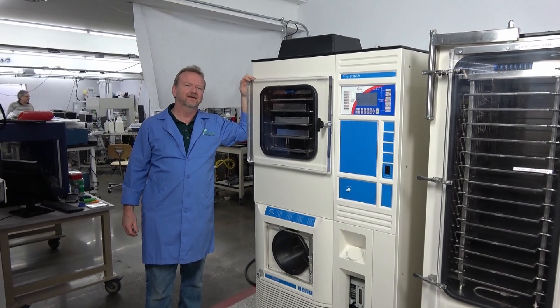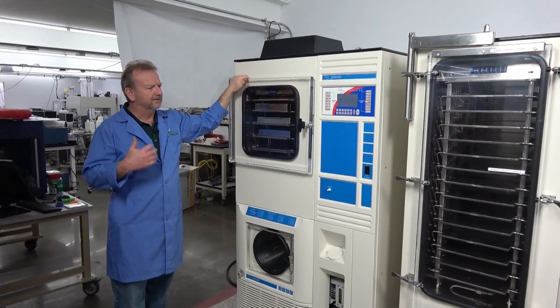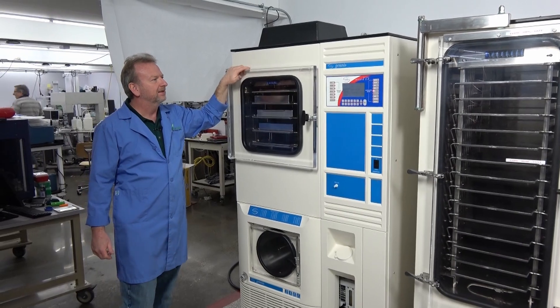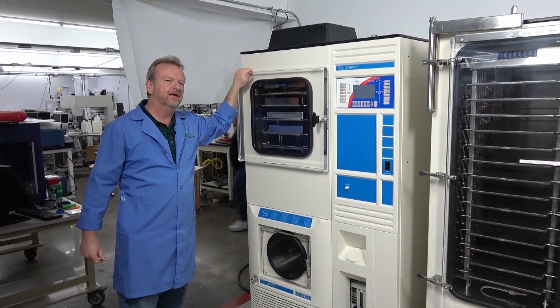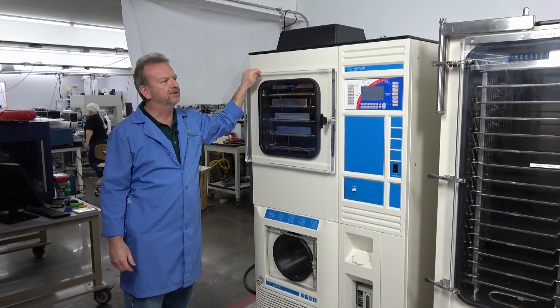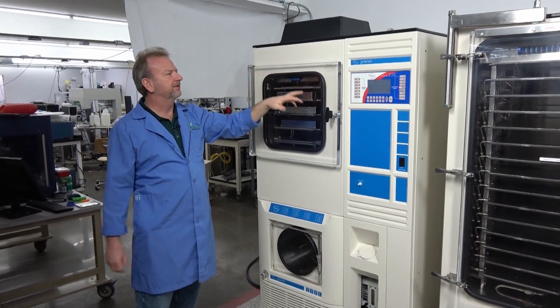Hi, I'm Rich at New Life Scientific, and today I'm going to talk about the Virtus freeze dryers — especially the smaller to the bigger ones — and give you an idea of how to scale up from your laboratory. When you're doing small scale and you want to step up production to get closer to full production, we're going to look at a few machines that Virtus has to help you do that.